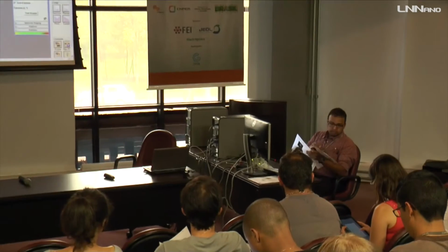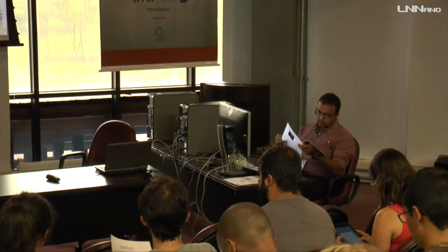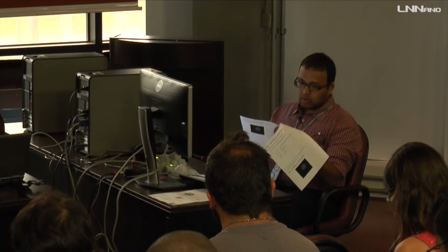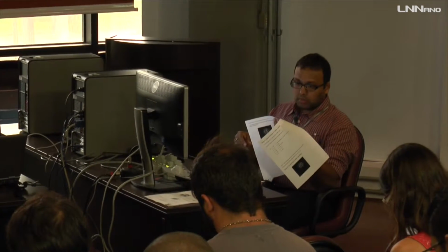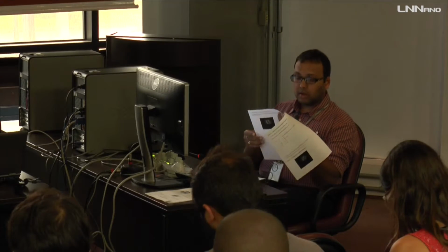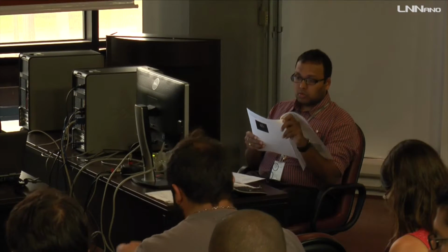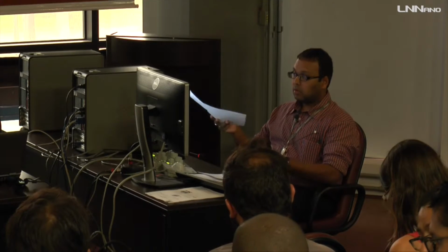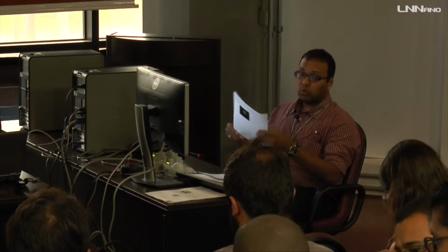If you go for hexagonal or any other crystal system, you need to change that formula. And then in step number 6, the angle determination, that formula changes for different crystal lattices. So as the sample that I'm using in this demo session is silicon, I have given you this indexing pattern, how to index a cubic crystal.